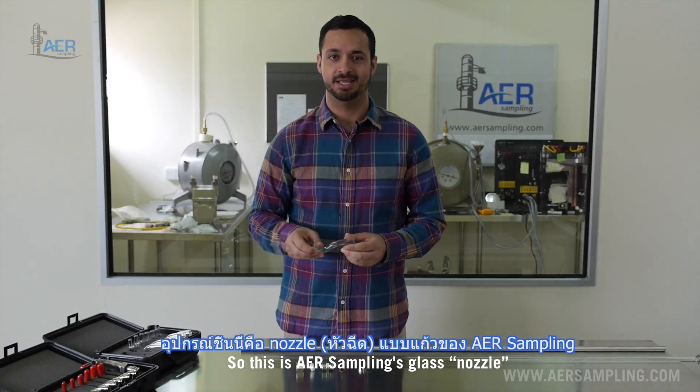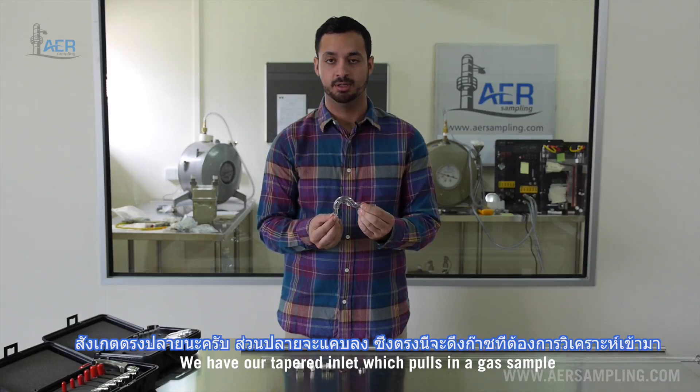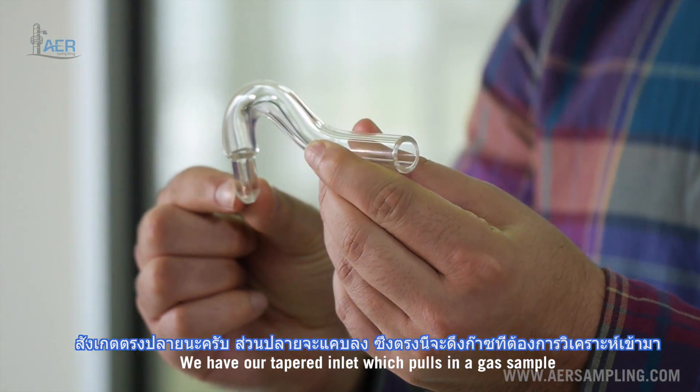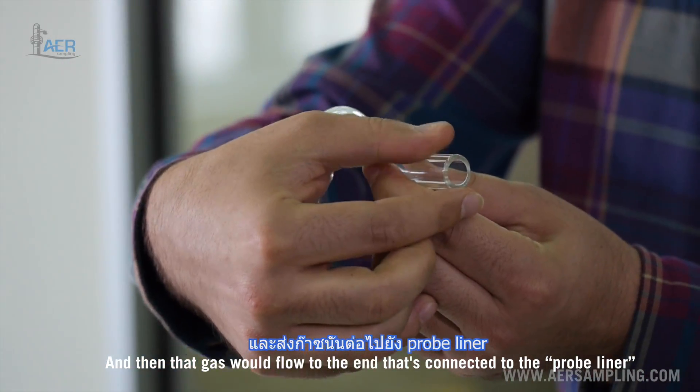This is AER Sampling's glass nozzle. We have our tapered inlet which pulls in a gas sample, and then that gas will flow to the end that's connected to the probe liner.